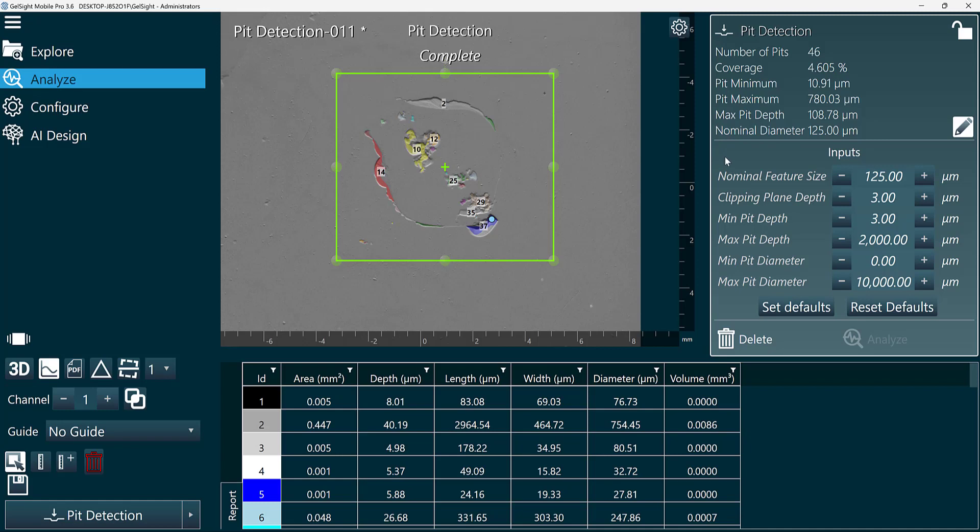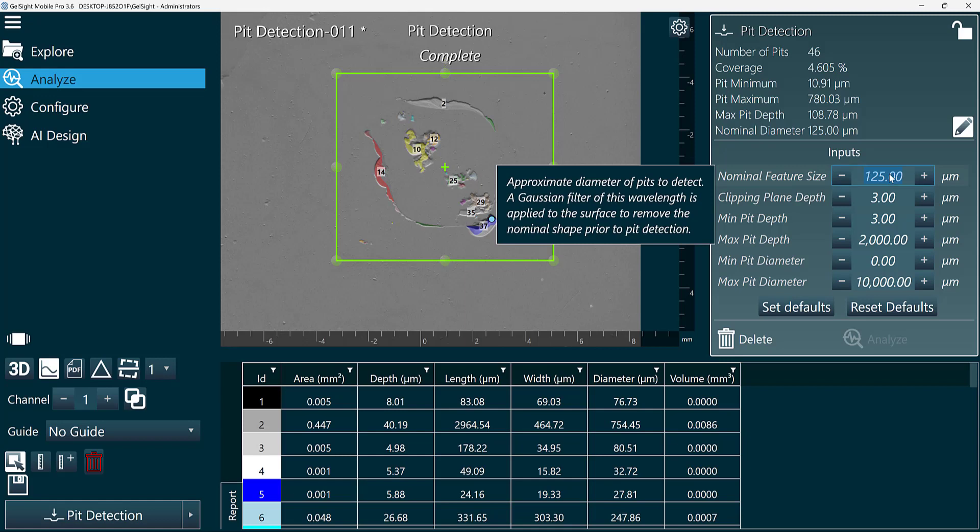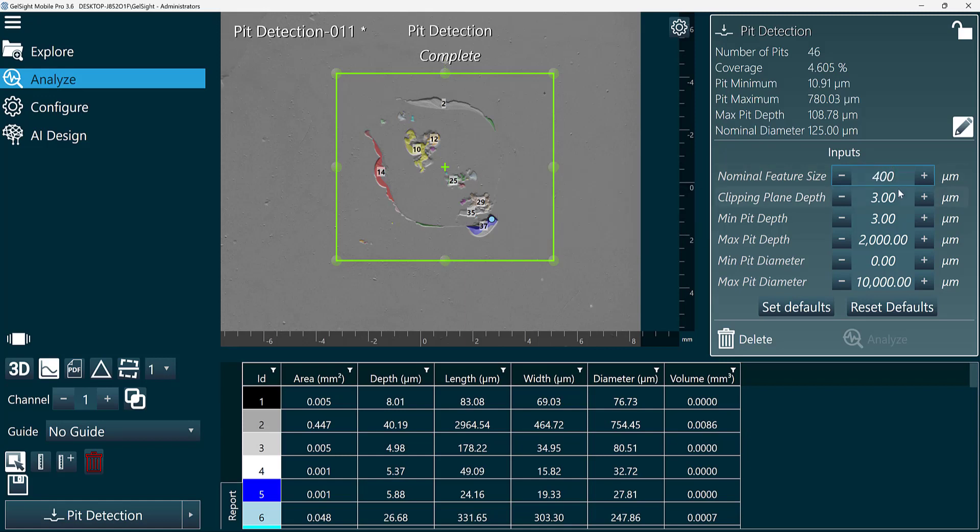You can set nominal feature size to be the approximate size of the pits that you're looking for. And the clipping plane depth will determine what valleys we want to consider pits. In this example, maybe I'll set this to 400.